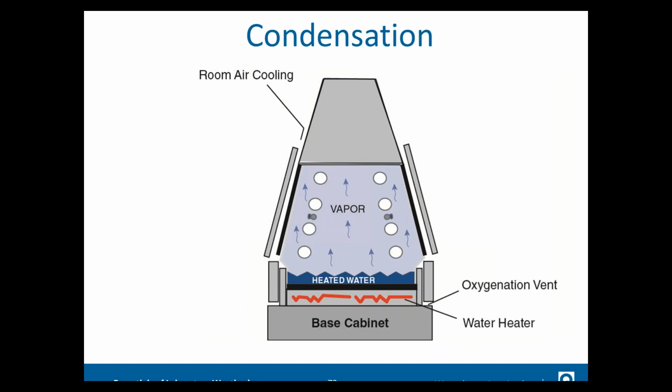So the way this works is that we have heated water that fills the chamber up with hot, moist air. And because there's room cooling on the backs of the specimens, it cools the front of the specimen enough that in that local area, it gets to 100% relative humidity, and water begins condensing on the surface of the specimens. So the benefit we have there is not only are you getting the realistic wetness, and can you get that for a long time, but it's high temperature. And high temperature means there's more moisture there, and it helps facilitate that chemical reaction. Whereas with water spray, you're almost always subject to whatever the temperature of the water coming out is.